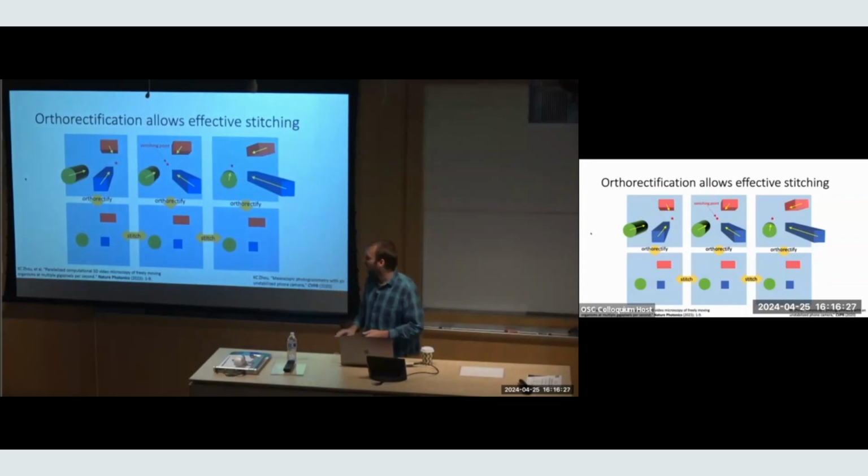And we use the metric of performance, of success, is simply our stitching accuracy, right? Are we getting better and better stitched images as we shift the pixels around? Once we're done shifting them all around, we have our height map, right?